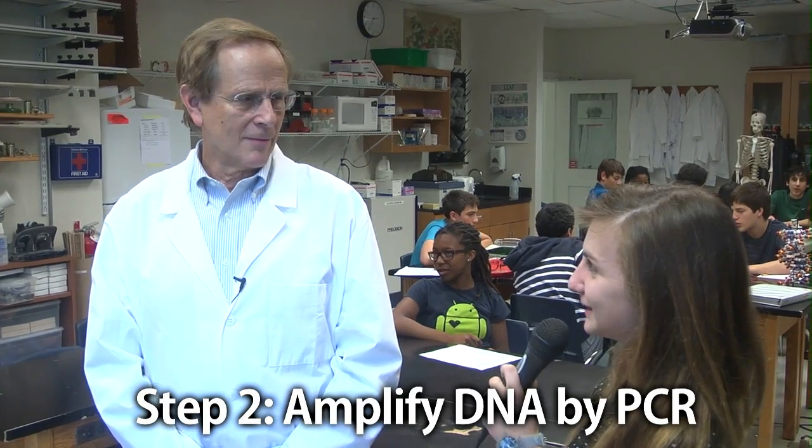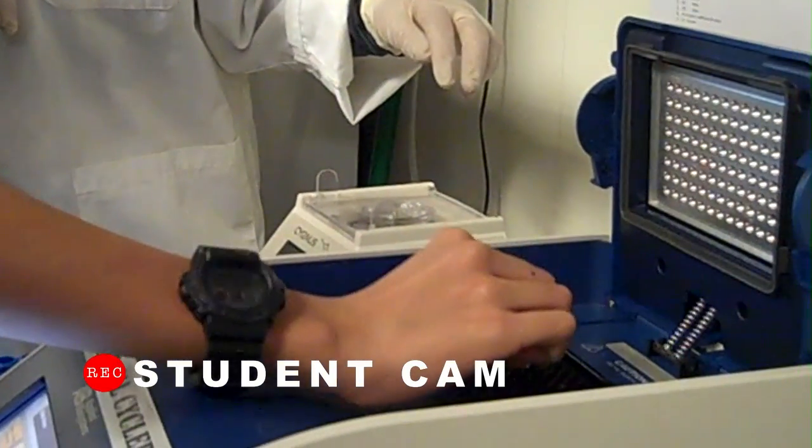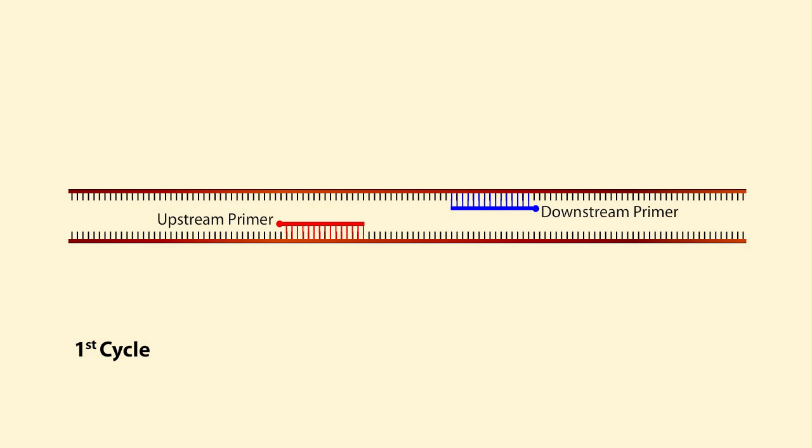Why do we use the PCR method in this experiment? Well, first of all, if you just start out with the original amount of DNA by itself, there's not enough of it. So you unwind it by heating it, and you send in primers that sort of tell you where to start and stop — where to make the copies.